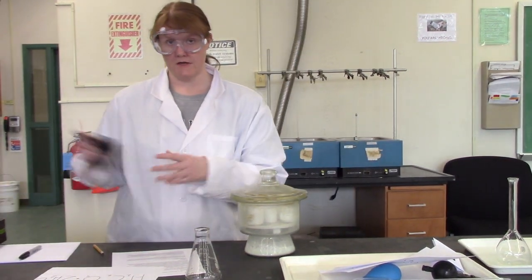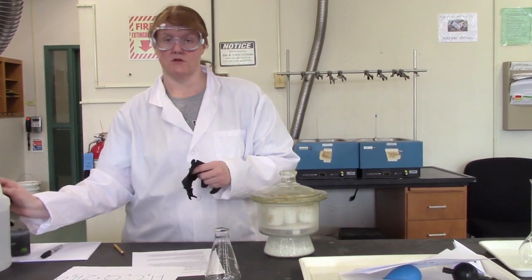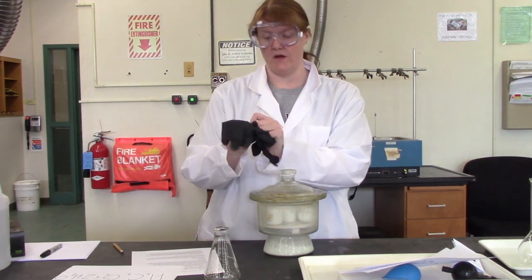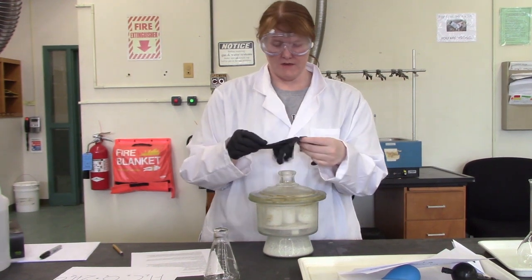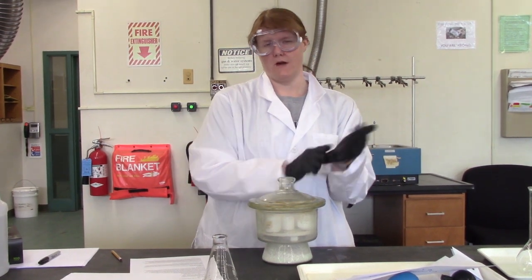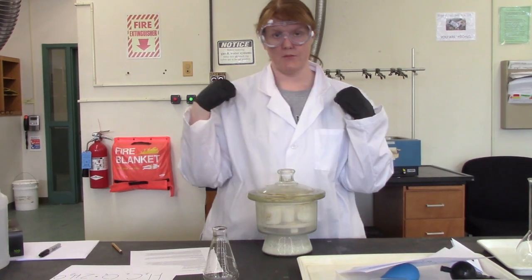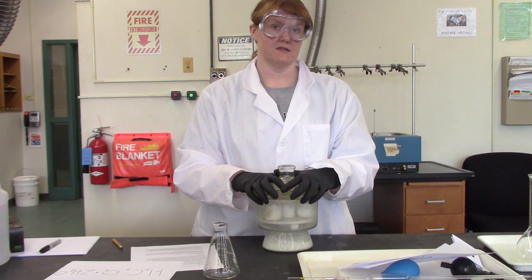I'm going to put gloves on because we remember from the safety video that acids are not super good for your skin. Remember when he put the egg in a beaker and then added sulfuric acid and it looks like a fried egg? Well, my skin is really similar chemically to eggs, so I don't want fried skin. It's gross. All right, so gloves, goggles, lab coat or lab apron for the whole experiment, because you are working with acids and bases the entire day.